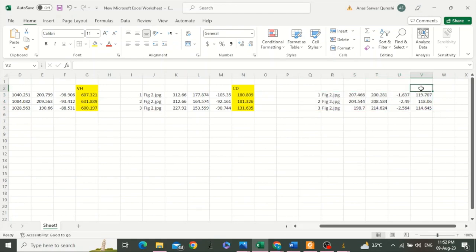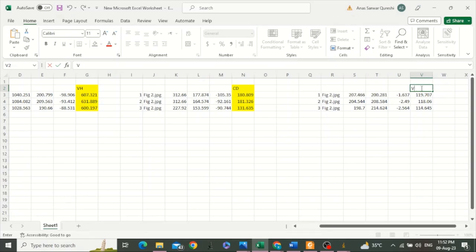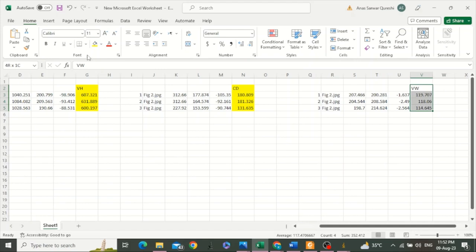Then select all these values, right click, copy, go to Excel, and paste. So this is villus width.